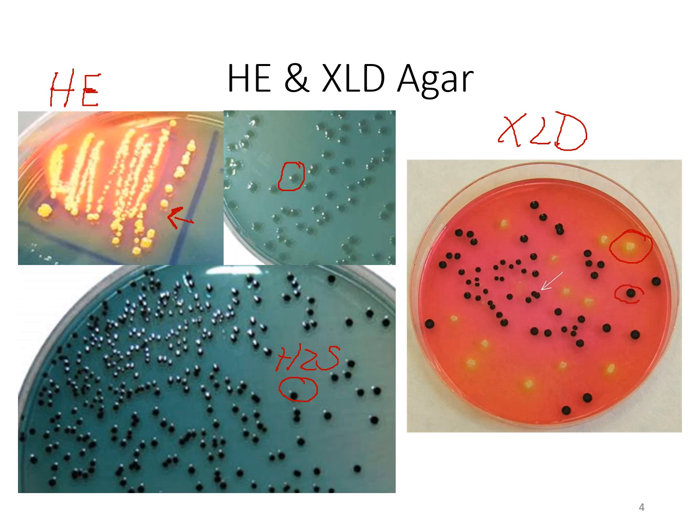Your XLD colonies would present as yellow for most organisms. Salmonella would be a deep red color with that black center for that H2S production. Your Shigella would be clear, colorless, so it might just appear as a red colony, but you can actually see through it.